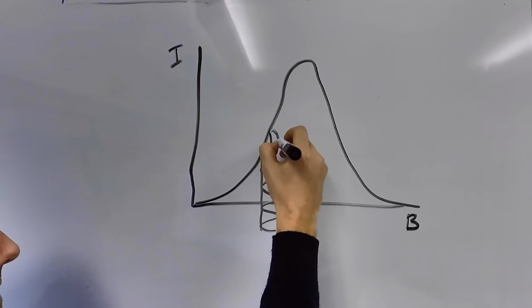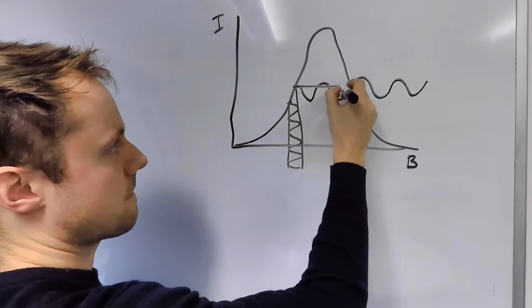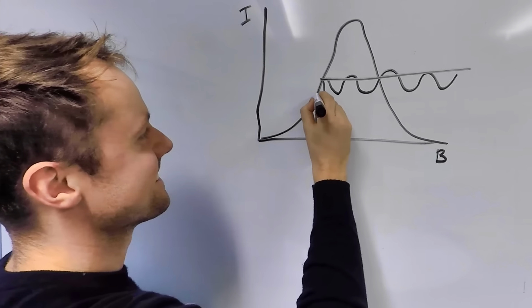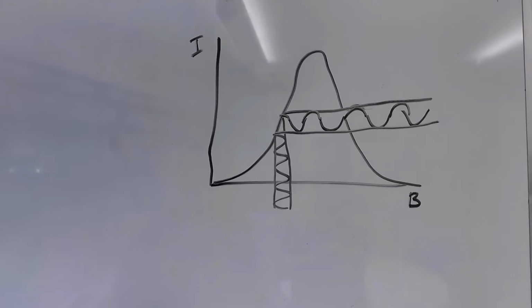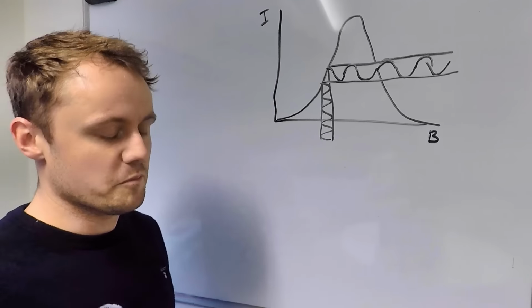So we end up with a response that looks like that. Or, sorry, I'm a physicist. I didn't do that for my drawing skills. Okay, like this. So this is why we get an oscillating signal back.